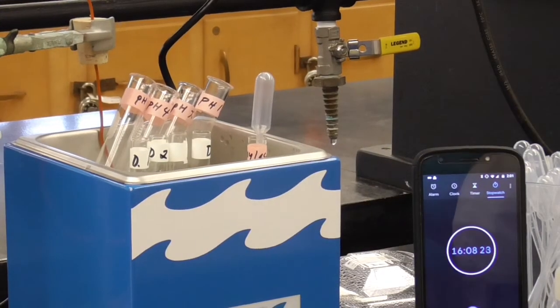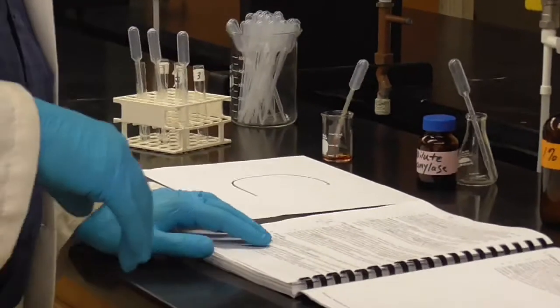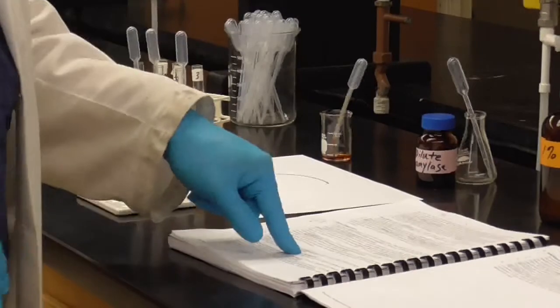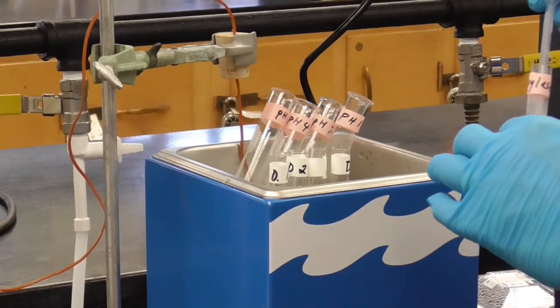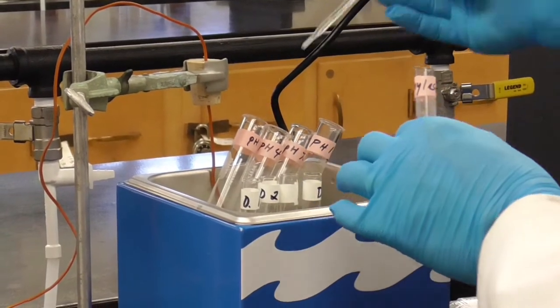So those are identical at this point. Those are just the starch solutions. Finally, it says to add 4 drops of the amylase solution to each buffer. All right, those are already over here. That is the enzyme again. We're putting the same amount in each one. So we can do that right here while it's in here.